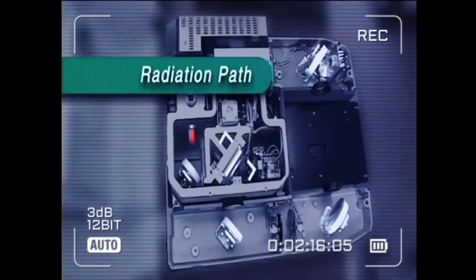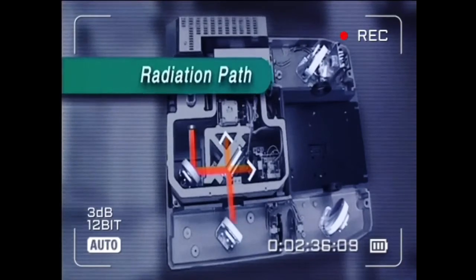Modern instruments such as this one use a device called an interferometer, consisting of a beam splitter here and a pair of mirrors at right angles to one another. This produces what is called an interferogram from the source radiation. The interferogram holds information about the intensity of infrared radiation of all frequencies simultaneously.